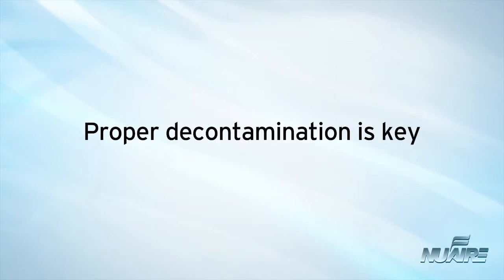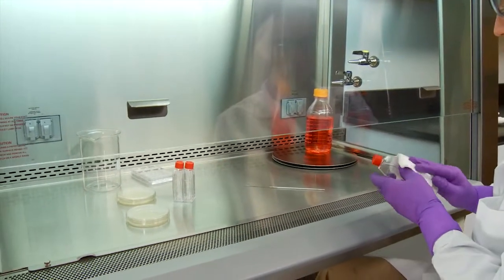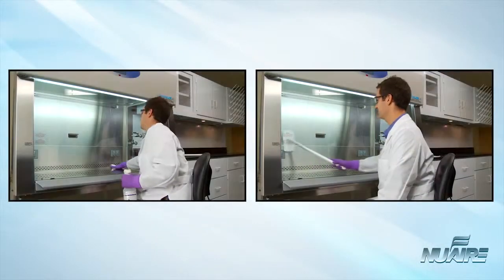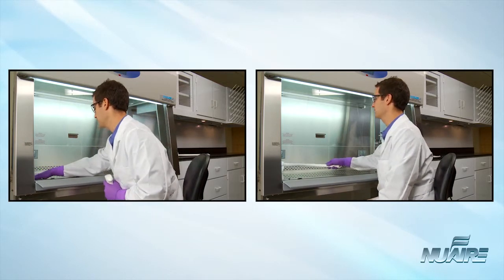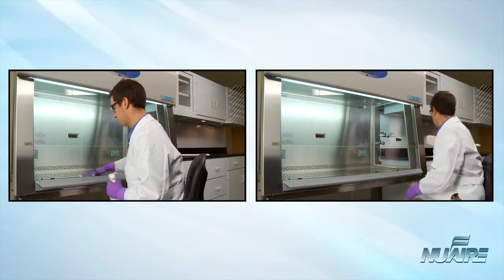Enclose any items which have been in contact with the agent and decontaminate the surface. All containers and equipment should be surface decontaminated and removed from the cabinet when work is completed. At the end of the workday, the final surface decontamination of the cabinet should include a wipe down of the work surface, the cabinet's sides and back, and the interior of the glass. If necessary, the cabinet should also be monitored for radioactivity and decontaminated when necessary.